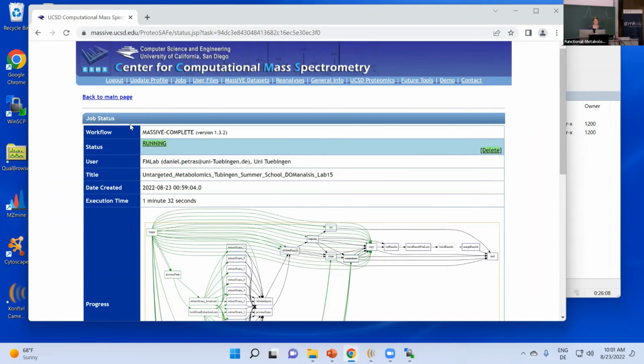So yeah, this is actually a really important point, and maybe to add on to that. The repository is static in one direction, right? So you can only add files there, but you cannot remove files. This is important because you get the DOI, the digital object identifier, and obviously you should not be able to delete files after you created that. So once you make something public in there, it's public.